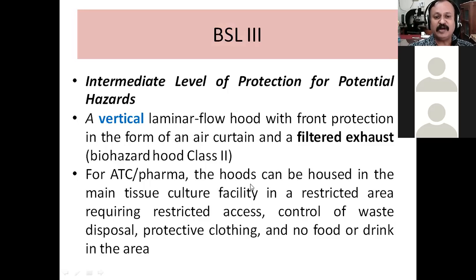This particular cabinet is housed in a tissue culture facility, which is essentially a restricted area and requires restricted access. So you cannot keep the class 2 biosafety cabinet anywhere in the laboratory. You keep it only at a very specific location, a restricted area.